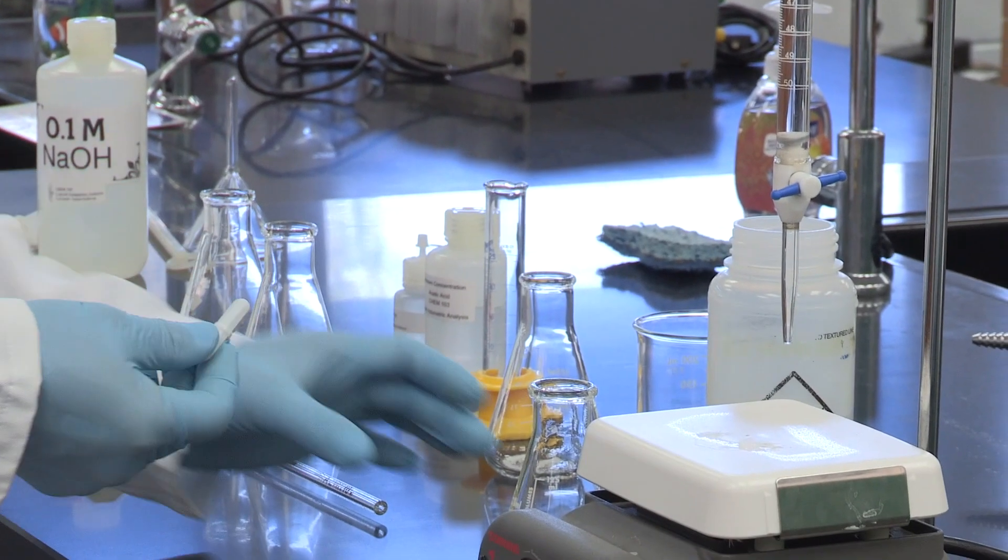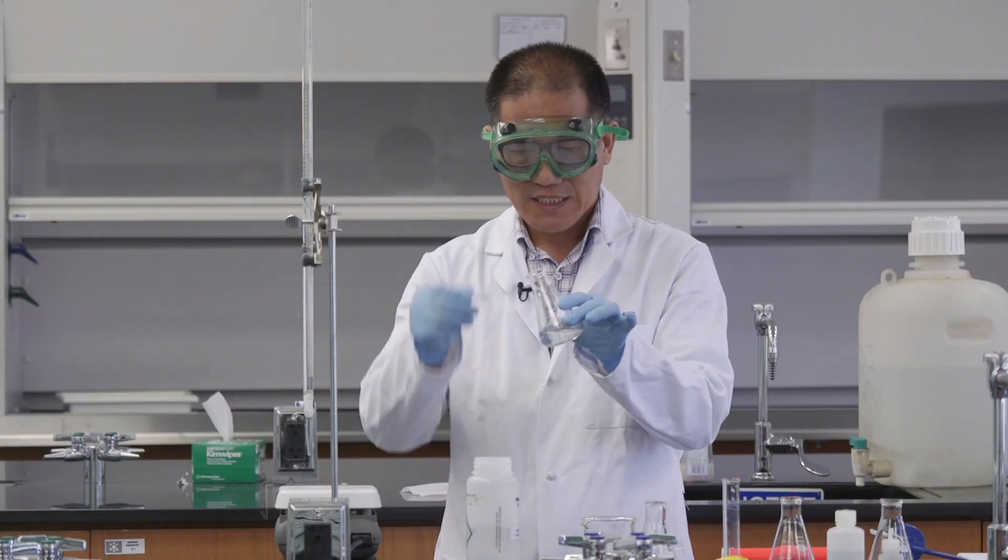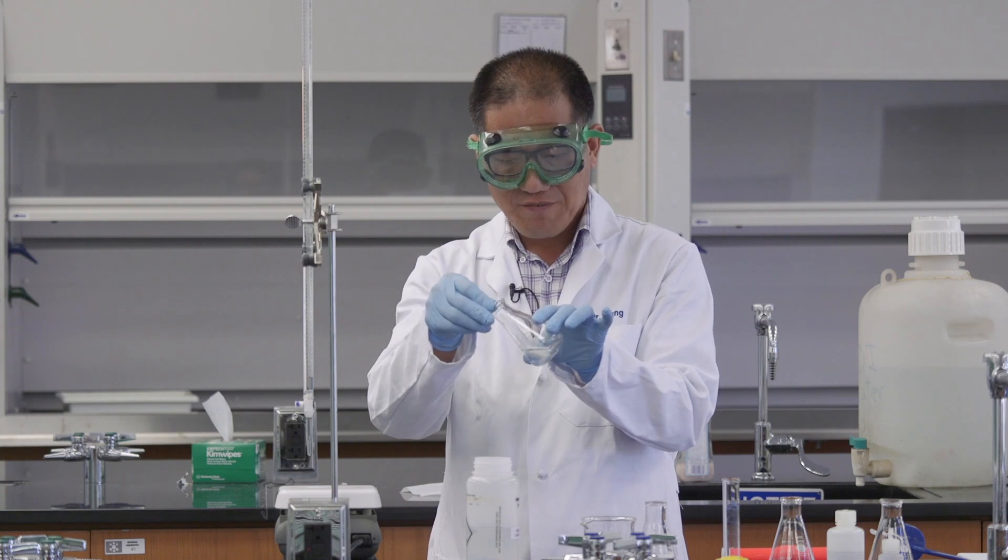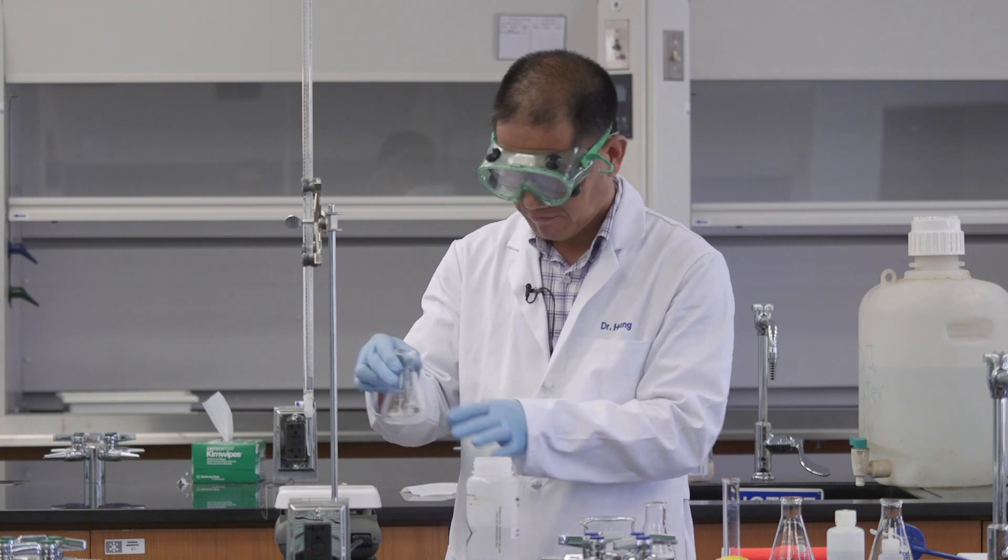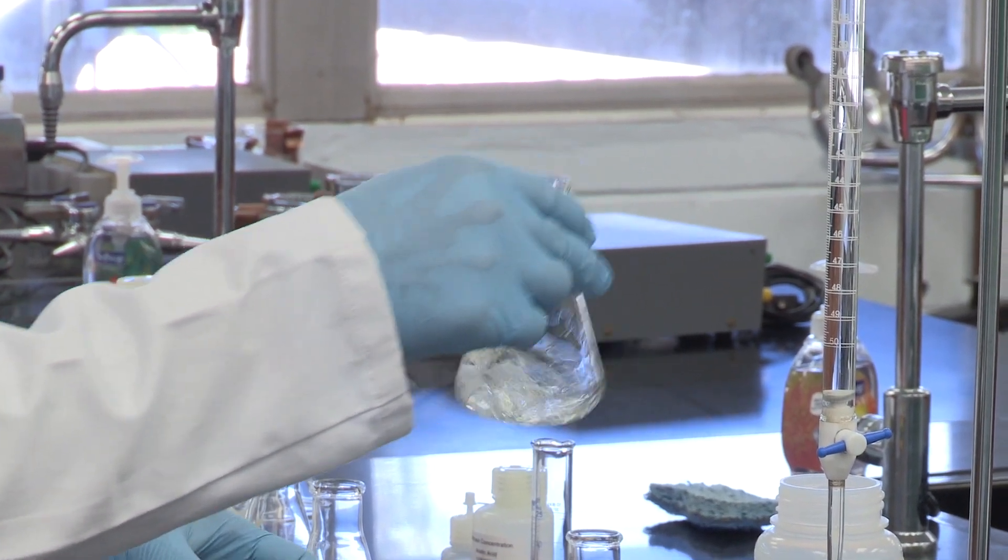Now I'm going to add the stir bar into this Erlenmeyer flask. I want to stir that so the dissolving can be very fast. At the same time, I can swirl this so it will dissolve faster.